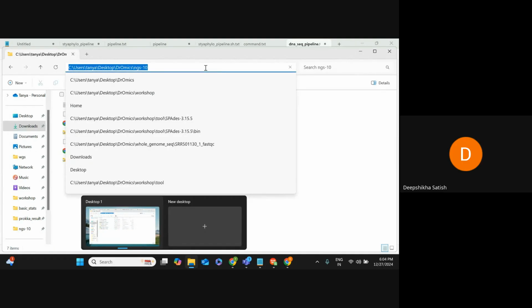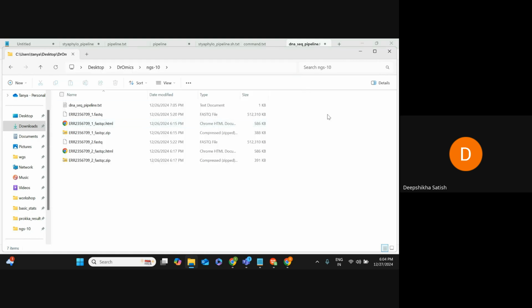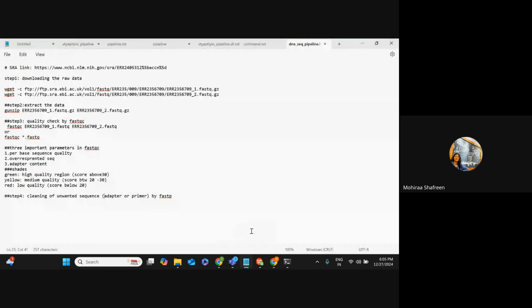So from here, you just open the ws. Do I have to type fastp now? Yeah, type fastp.